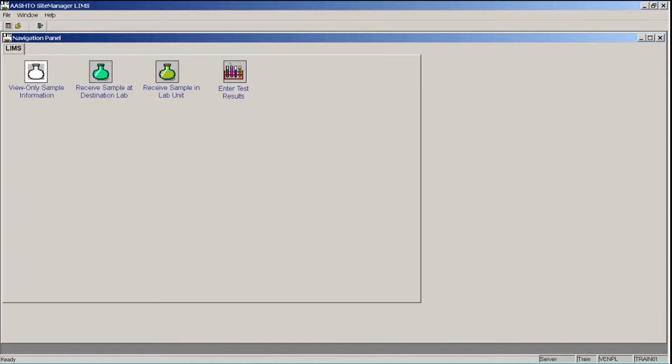At GDOT, you will access Site Manager and LIMS through Citrix. Log on to Citrix following the instructions provided to you by GDOT. You will then log on to Site Manager via GDOT's virtual applications.